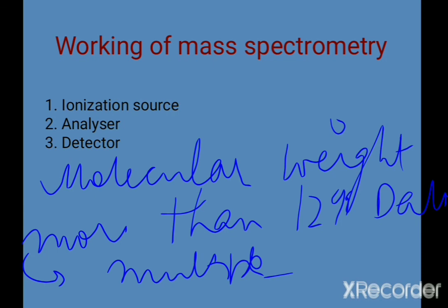Also, there are many suitable sites of protein which undergo protonation. All the backbone amide nitrogen atoms and side chain amino groups can be protonated.